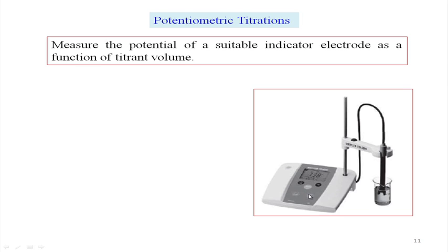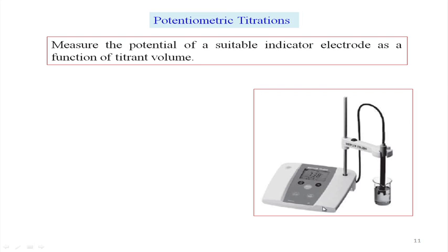When you directly measure the pH value, we get the corresponding neutralization point, and we know how we get the corresponding plot, and we can detect, by using the indicator, where your end point is.